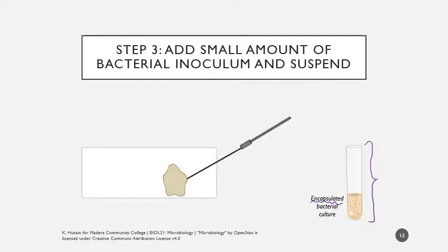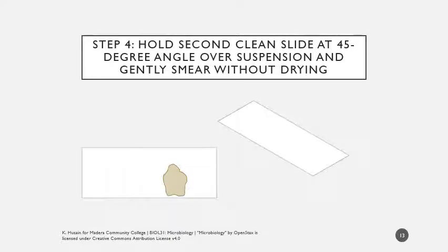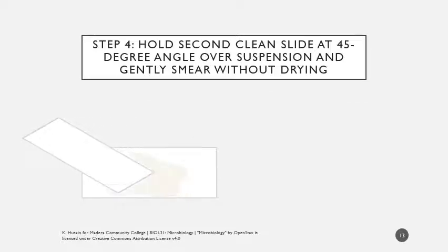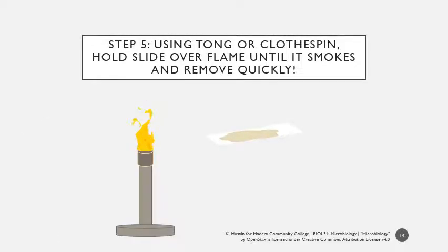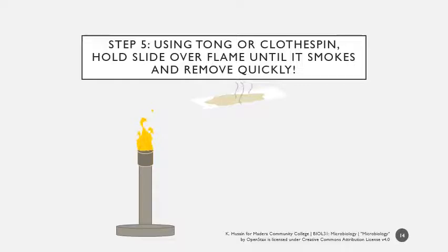The next step is to spread this across the surface of the slide, like we did with negative staining. We're taking a second clean slide, holding it at about a 30 to 45 degree angle over the suspension, aligning the edge with the smear, and slowly and smoothly dragging it across without allowing this to dry. Now we have this spread across the surface of the slide. Then we're going to clamp the slide with a clothespin and hold it over the flame until it smokes, then remove it quickly — not true heat fixing, but setting everything in place.